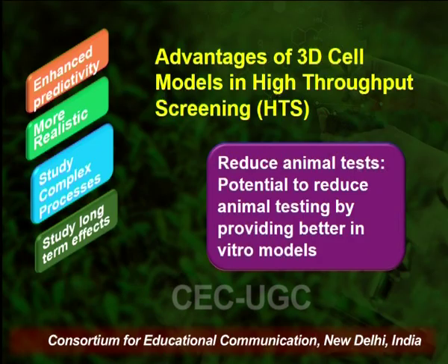Now, I will just briefly give you an idea about the protocol that has to be followed while using high throughput screening. Till now we have discussed HTS, its classification, and different assays, whether they are in vitro or in vivo, that are being used to evaluate the potential drug molecules or the lead molecules.